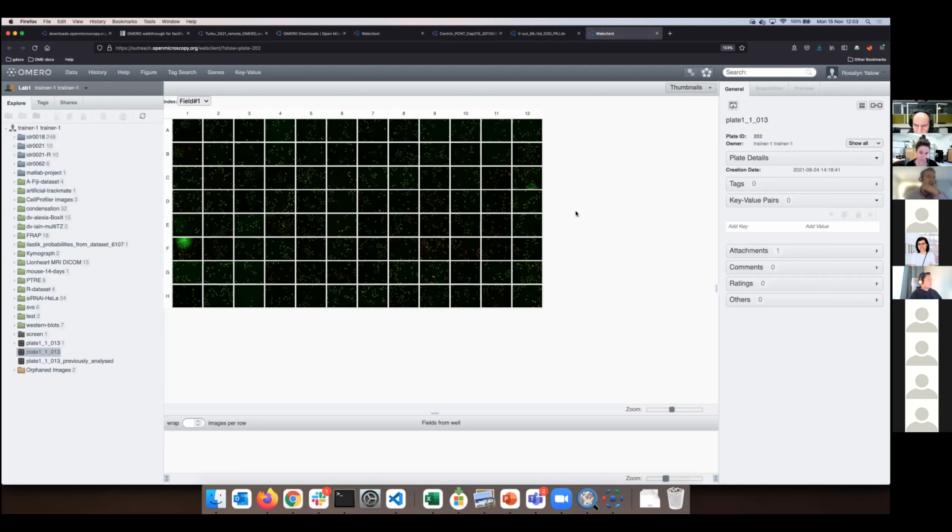Would it be possible to share the link to the image so that people who have no account on the server can still view the image data and annotation? Yes, it is. Thank you. This is then in a need to, so to say, bypass the credentials barrier. Okay, so we are here on the server behind a barrier, and the URL of the server, the link, is public. It might not be.